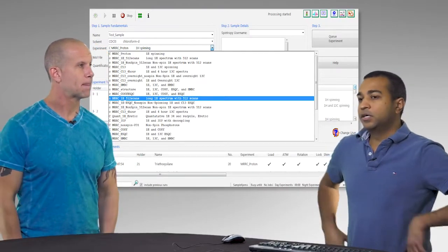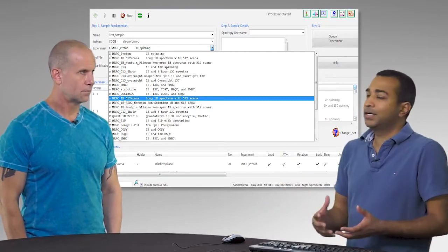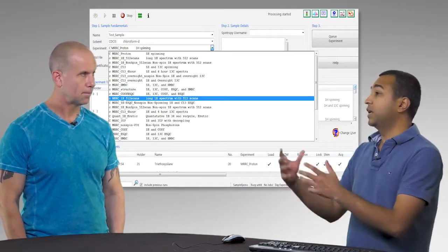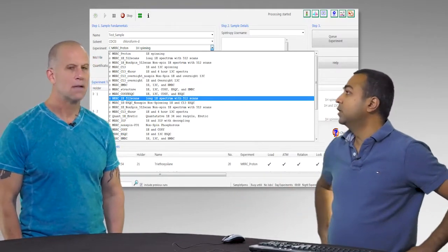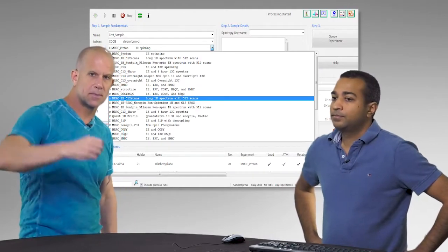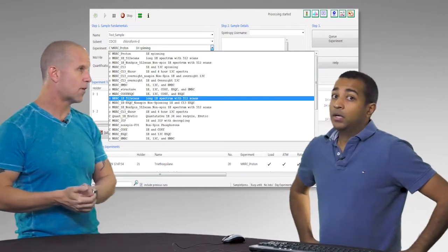The instrument actually has a day queue and a night queue. So if you're running a 6-hour carbon, it's smart enough to automatically push that into the night queue, so you're not backing up the instrument for routine proton experiments during the day for 6+ hours. And that's what the middle and the bottom window can show you: how many are in the queue in front of you.